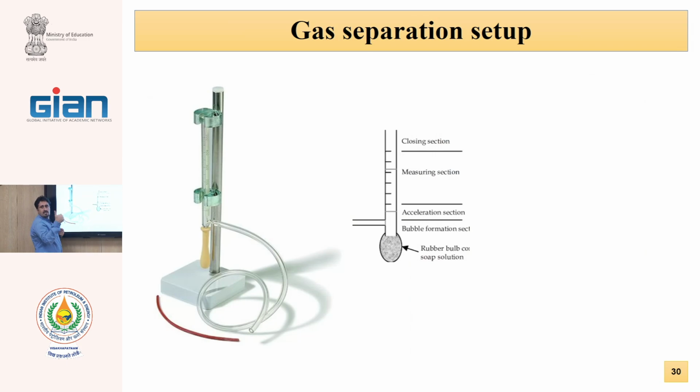When it reaches here, we begin the timing. And this bubble goes here, and after it reaches here, we measure the time. For example, for passing 10 milliliters, we need 10 minutes. With the volume and the time, we obtain the flow of permeated gas. This is a simple method. We have a digital one of this, which measures and reports numbers at different times. This is the constant pressure method.